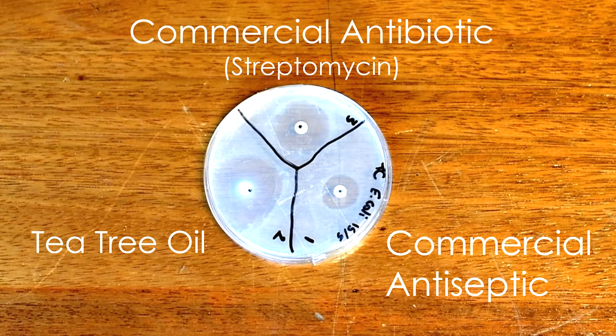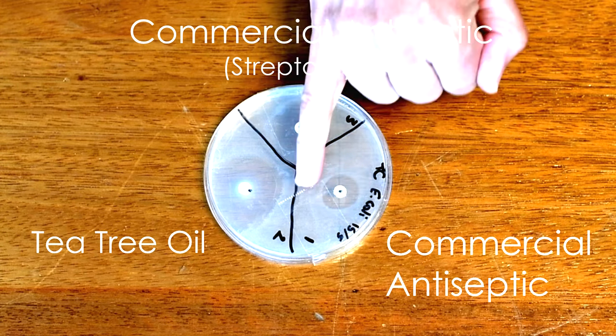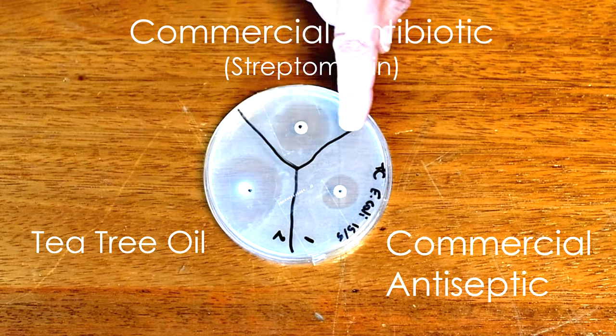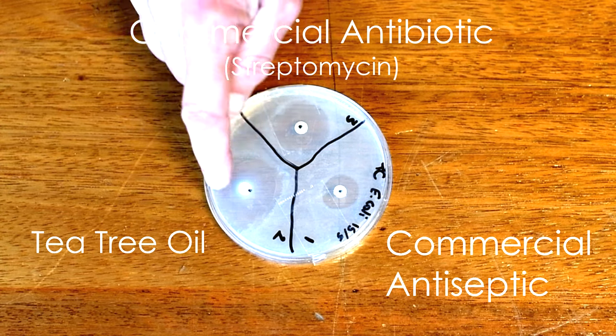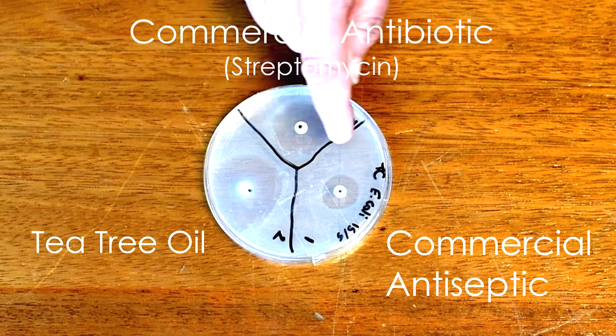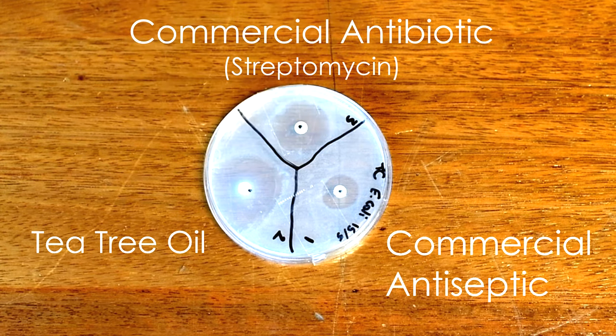A couple of days have passed and we need to return to our agar plate to see how things are developing. You can see that where the agar was completely clear, it's now cloudy. Each part of that cloud is due to individual bacteria that you have spread evenly across the plate, dividing by binary fission to produce tiny little colonies, which we are seeing now as a cloudy area on the plate. There are clear areas where the bacteria have not grown — these are the clear areas where we put down our little discs. The antibiotic disc, and the other two were the cleaners. The tea tree actually has a larger radius clear area around it.